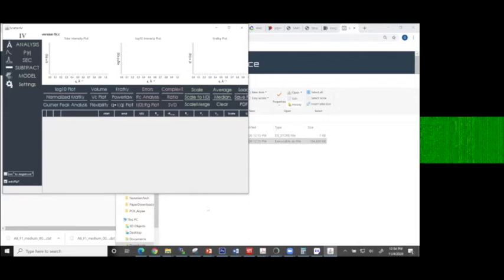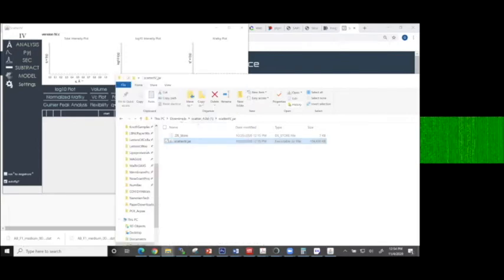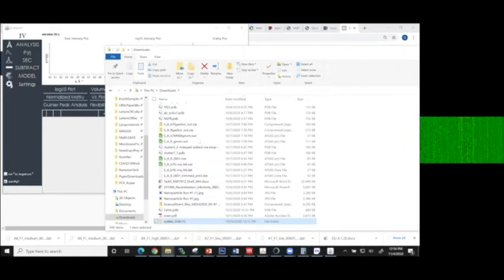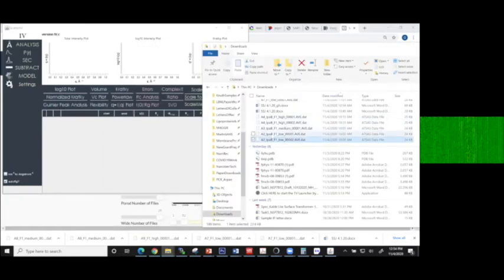All right. So I'm going to go back to my downloads. So I've used scatter and the frame slice, and I've generated my A2 files, so from buffer 1 and buffer 2. So there they are. And I can drag and drop them into scatter.